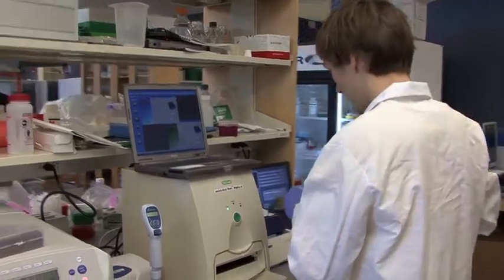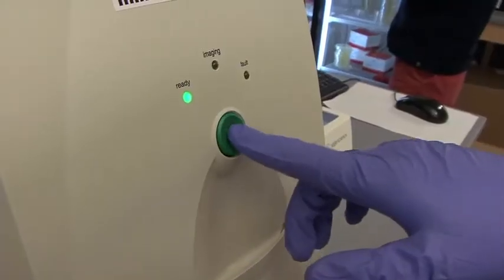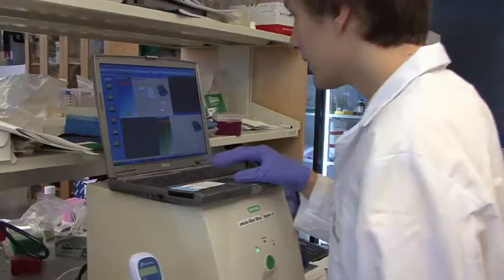GelDoc EZ sits on our bench, and so it's right next to where we run our gel, so we can quickly just see if our gel has run long enough.